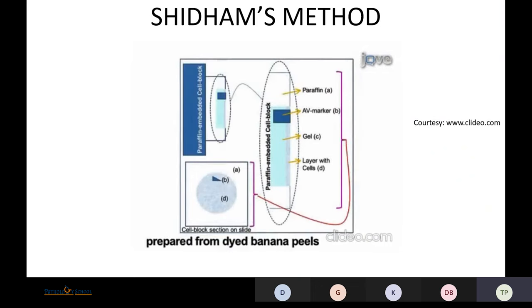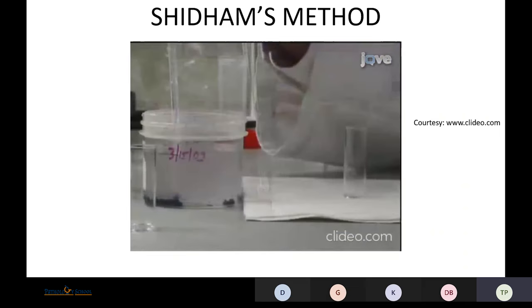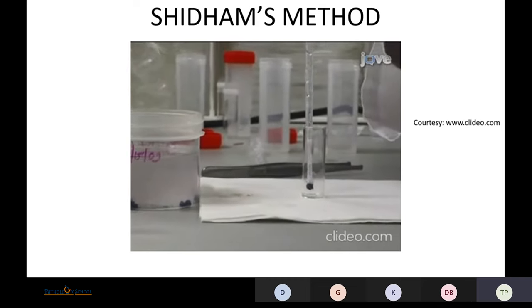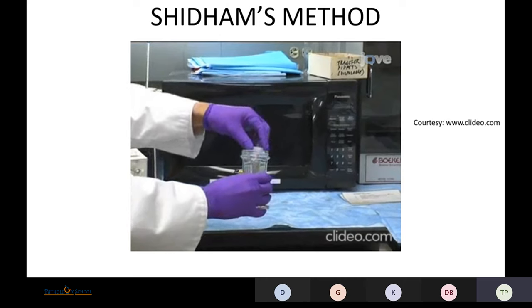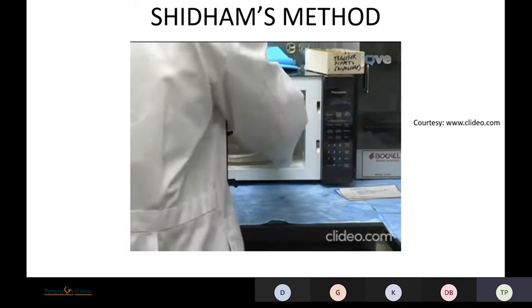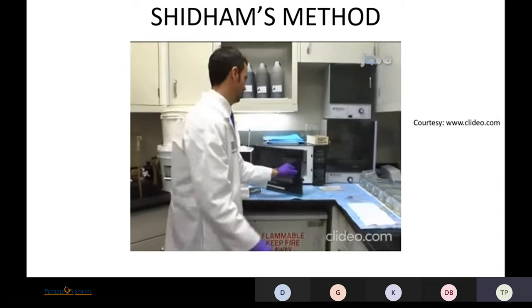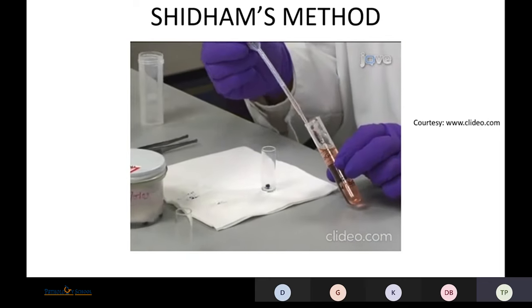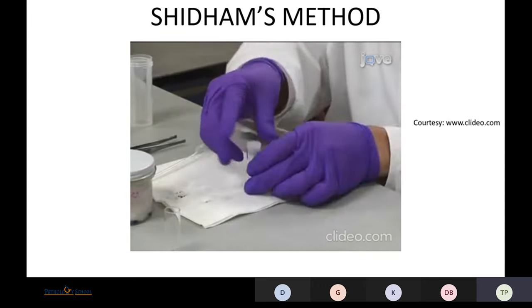A dark AV marker (Anjani Vinod marker) is added to the cells as a signpost. After embedding, the AV marker identifies the level at which cells are concentrated within the paraffin block. Using a special pipette, add a previously prepared AV marker flat-surface cube to the cells in the tube. Then liquefy an aliquot of histogel (HG) by melting in a microwave for 10 seconds at medium power. Add 0.5 ml of the molten HG to the tube containing the sedimented cells, quickly mix, and recap the tube.